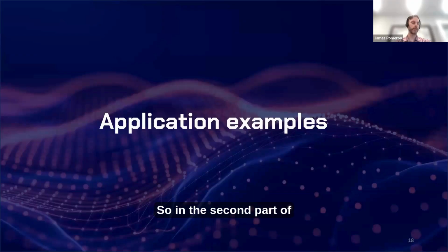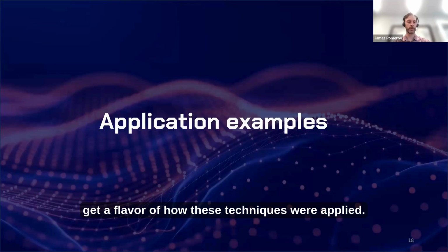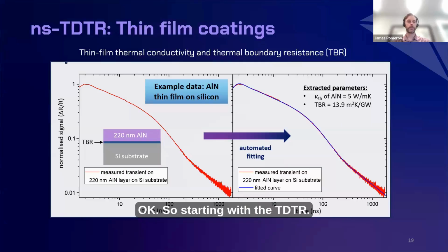Okay, so in the second part of this webinar, I'm going to present some application examples so you can get a flavor of how these techniques are applied. Okay, so starting with TDTR.